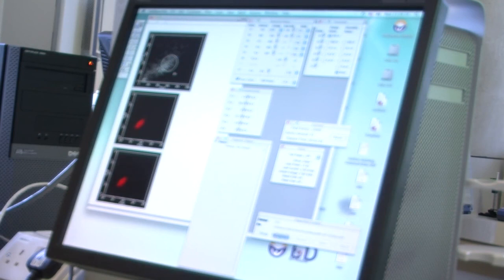There are markers that you see as actually, oh yes, fantastic. My gut feeling is it's not quite as bright as the positive controls, but definitely positive. This is the third of the set. Okay, yes, this is the ending. Have we done the negative one yet? Yep. Negative had very little in it. Positive had quite a lot. This has got some. Again, the actual numbers will reveal it.